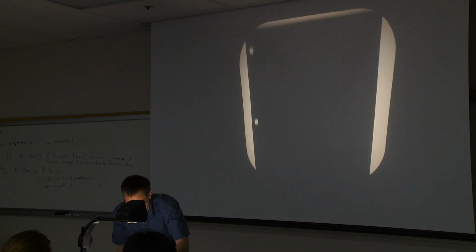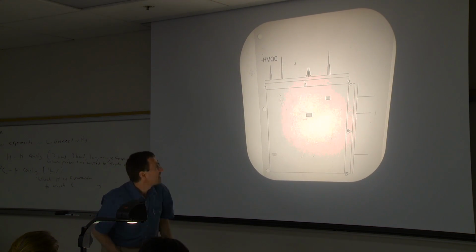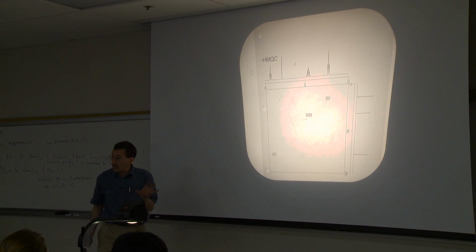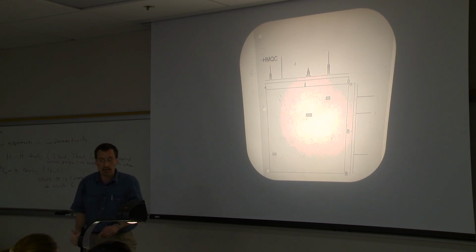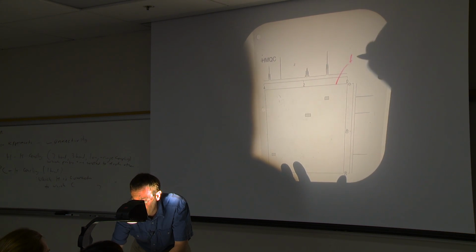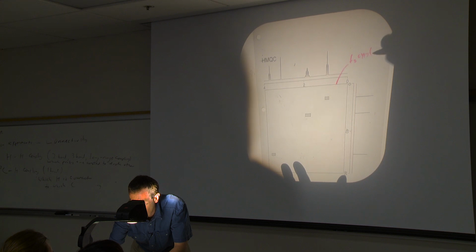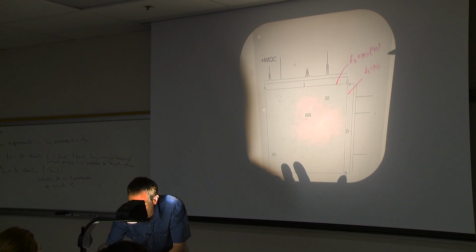This is an HMQC. HMQC is the heteronuclear experiment that gives our carbon-hydrogen couplings. On our F2 axis, we have the proton dimension. And now, on the F1 axis, we have our C13 dimension.